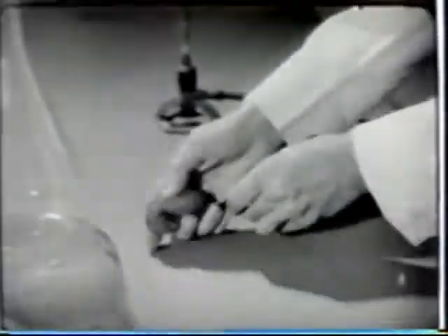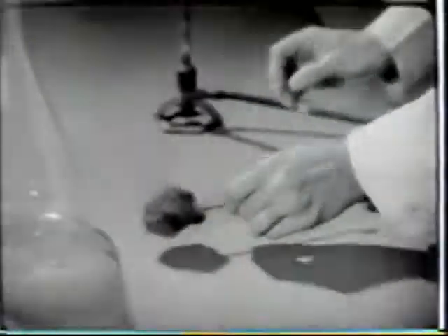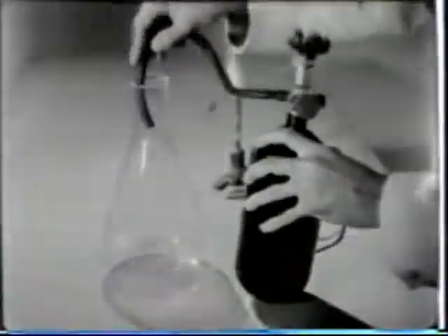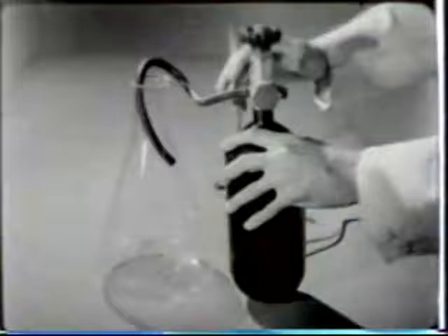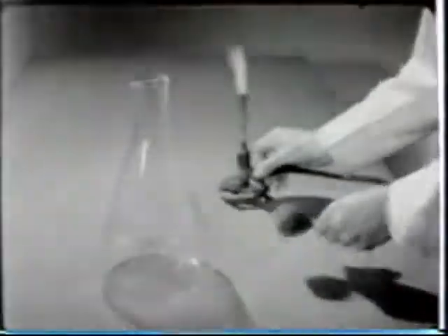The part that oxygen plays in supporting combustion can be further illustrated by this experiment with steel wool. A flask is filled with pure oxygen. A wad of steel wool is then held over a flame, and it produces only a slight glow.